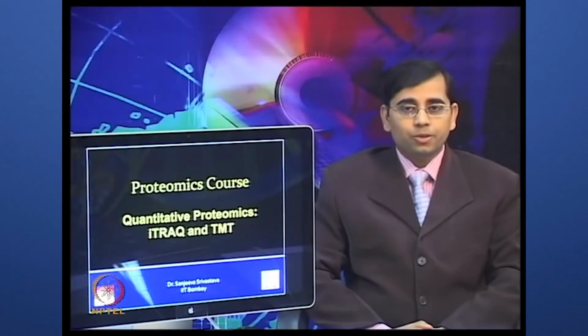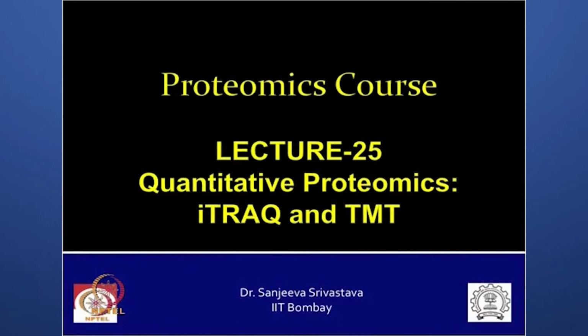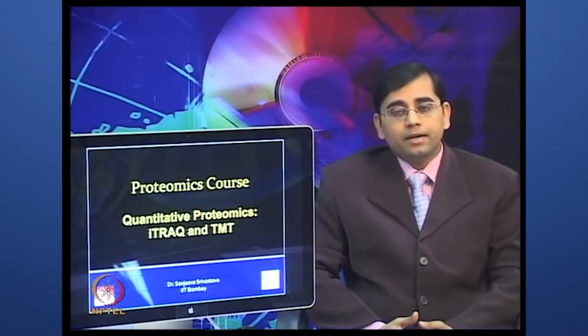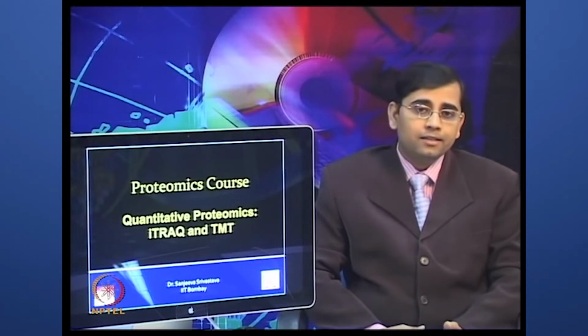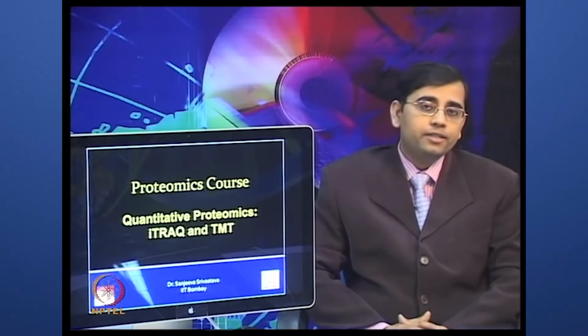Welcome to the Proteomics course. Today we will talk about quantitative proteomics and discuss iTRAQ and TMT techniques. Quantitative proteomics aims to answer various questions, including the identification of biomarkers for various diseases and target identification for early diagnostic intervention.